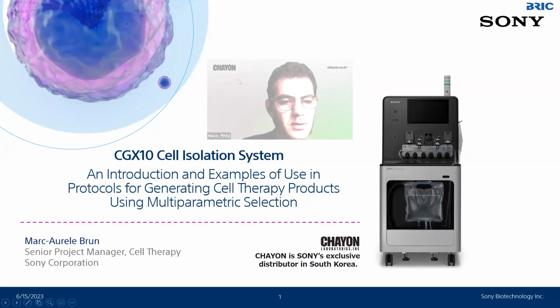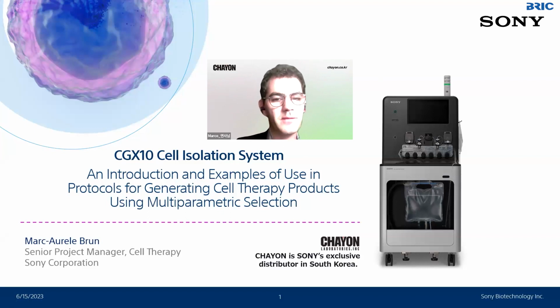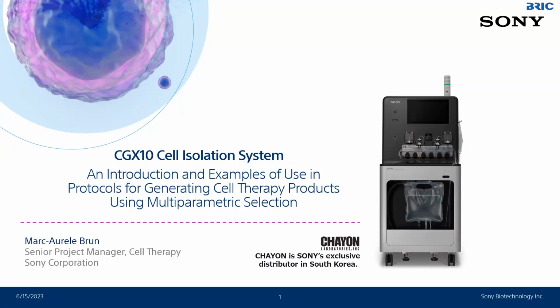So as the introduction said, I was in charge of the CGX10 cell isolation development, product managing, and I would like today to introduce you to the CGX10 general system introduction, and then some examples of its use in protocols for generating cell therapy products using multiparametric selection.